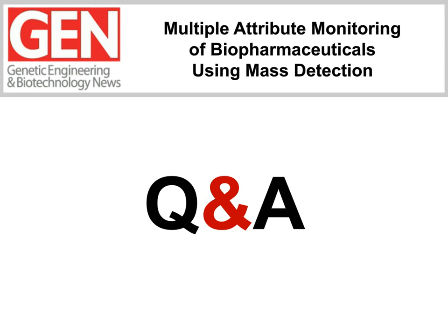Okay, great. Another question asks, what is the maximum mass range of QDA, with the max range of detection? What scan frequency in hertz will it be? So the answer to the first part of the question, the maximum mass range of the AcuityQDA is up to 1250 m/z, and that starts at 30 m/z. So that's the actual mass range of the quadrupole.